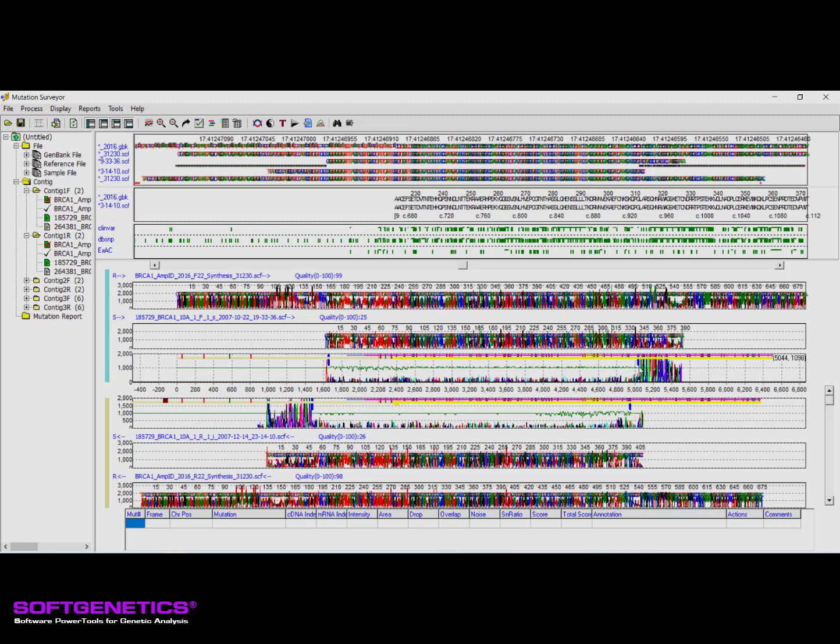The light tan horizontal bar indicates alignment to the gene region and the yellow arrowed bar indicates the coding region. Other regional information that can be displayed, if available in the GenBank file, includes regions of interest and primer regions as displayed here in pink and gray, respectively.